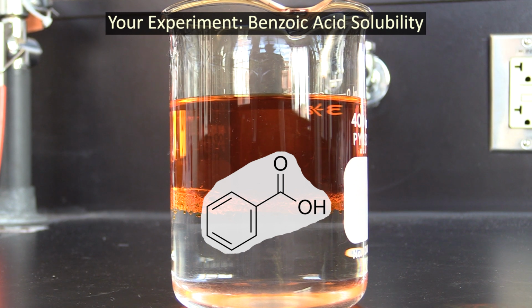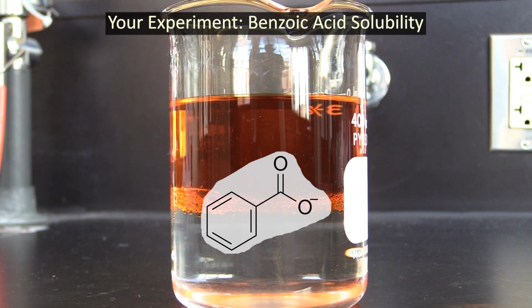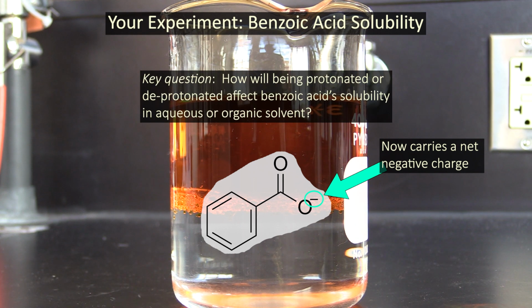Instead of using liquid-liquid extraction to separate two different compounds from each other, you will use it to determine how benzoic acid's protonation state affects its solubility. See, when benzoic acid reacts with a strong base like sodium hydroxide, it loses a proton, and, in doing so, it goes from being neutral to having a net negative charge. Over the course of doing this experiment, you will evaluate how this affects benzoic acid's solubility in aqueous or organic solvent.